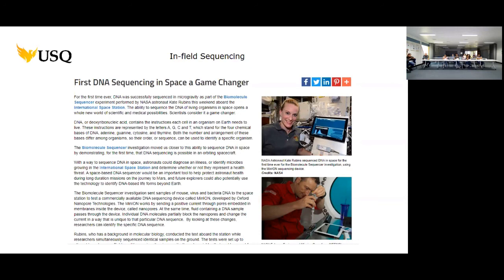And I think we have an extra challenge in that other samples are much easier to sequence. Humans and animals, you can get a much purer sample to begin with. When you're working with fungi, you've got a much harder time. So we've got some extra challenges there.